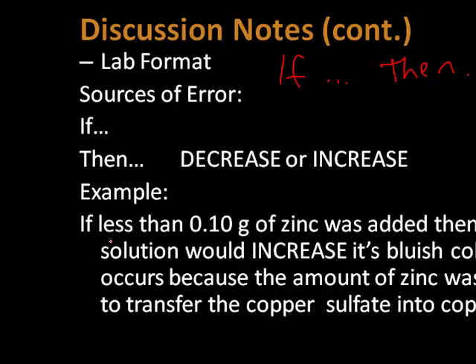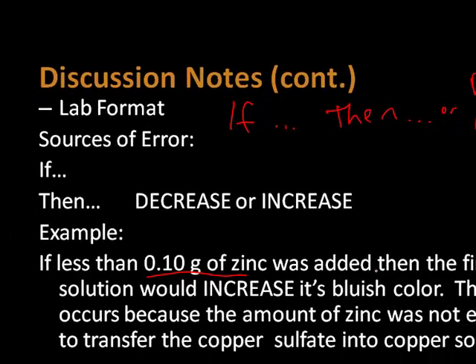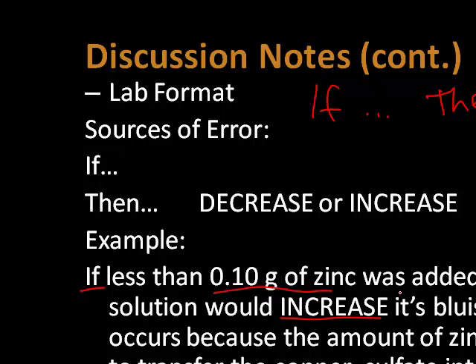So in this particular case, if less than 0.1 gram of zinc was added, then the final solution would increase its bluish color. That's the source of error.